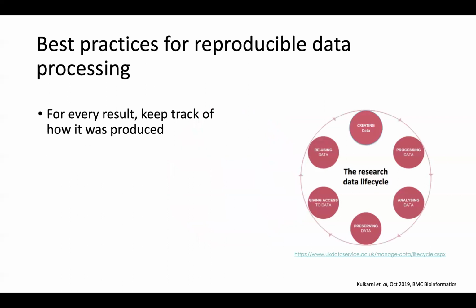So for what is required now, the best practices for creating pipelines or processing data are here. For every result, as I told you, keep track of how you produced the data. Every single command you write, put into a file, along with the versions of the software and the parameters you use, and be organized. This is what we started doing using Dolphin Next.